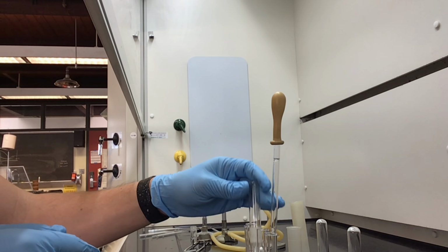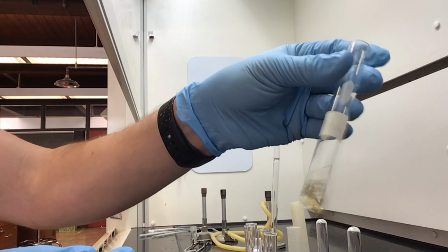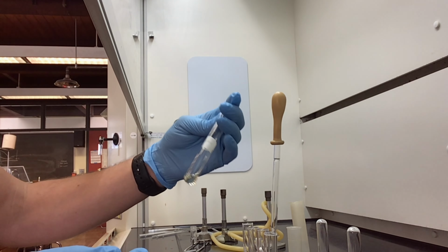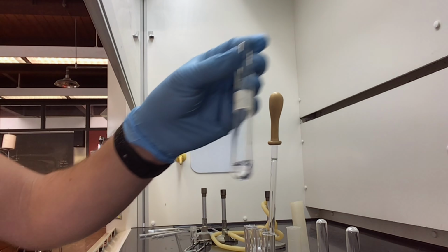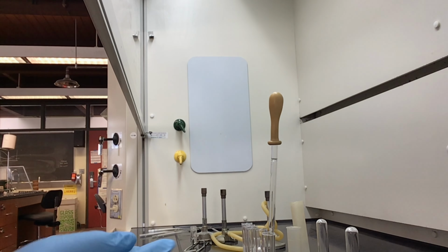No color, so now I'm just gonna double check everything else. That's my toluene. The aromatic compound is still yellow, has not reacted. And as we double check all of the unknowns, the results are the same. Okay, we're good to go.